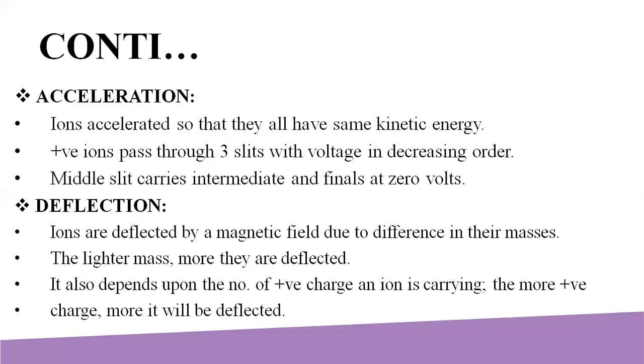A time of flight analyzer accelerates ions to the same potential and then determines how long is needed for them to hit the detector. If the particles all start with the same charge, velocity depends on the mass, with the lighter component reaching the detector first. Other types of analyzers measure not only how much time it takes for particles to reach the detector, but how much they are deflected by an electric or magnetic field.